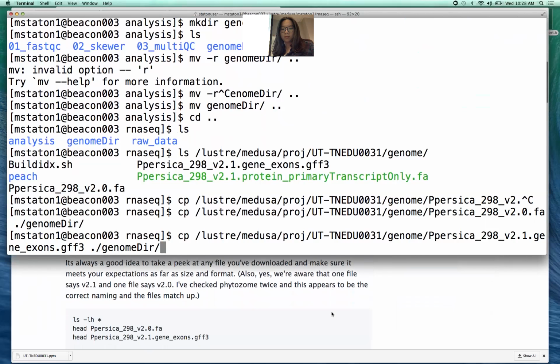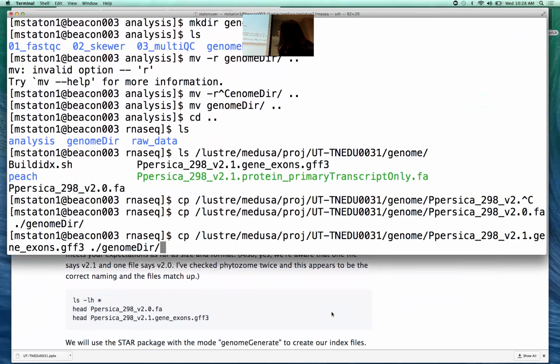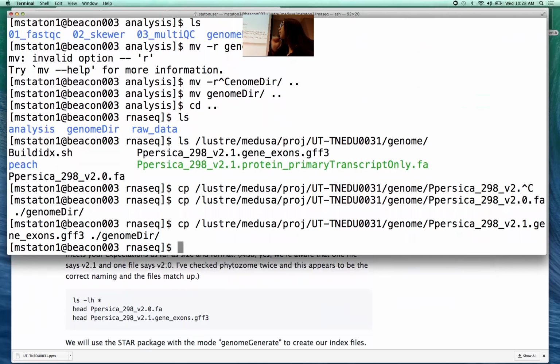It also has the location of each exon, it can hold the UTRs, basically any part of a genome that you want to annotate, you stick into a GFF file. You will also see GTF, which is very similar. So if you're looking for annotation, GFF or GTF are what you're looking for.